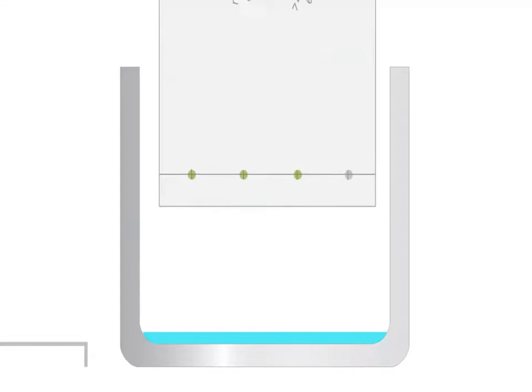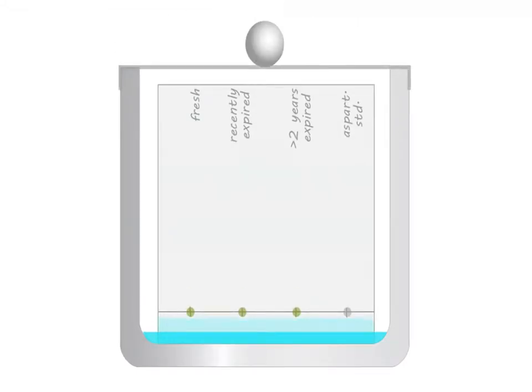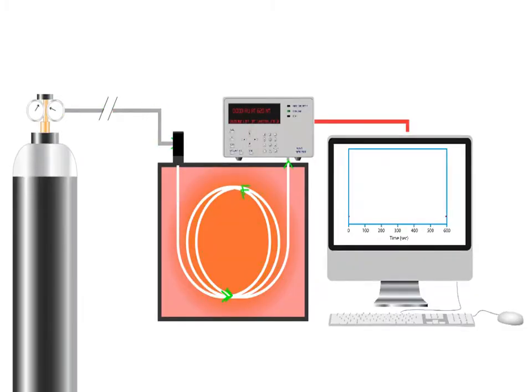We have looked at thin layer chromatography, TLC, where the mobile phase is a solvent and the stationary phase consists of silica particles coated onto a glass plate support. In TLC, the substances being separated travel at different speeds up the plate, since those substances that form stronger interactions with the stationary phase are held up the longest and travel slower. We will now look at gas chromatography.